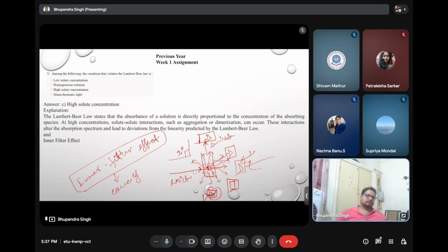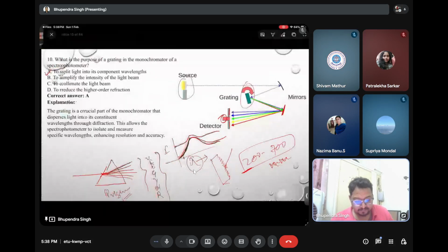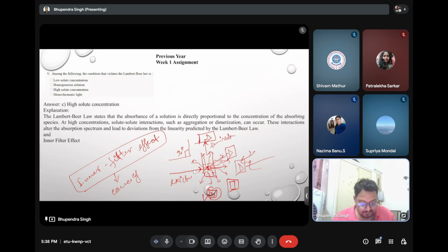Any wild guesses? Okay. So it is at 90 degrees because when you place the detector at this position, you will detect the transmitted light also with the emission, because not all the light you are giving for the excitation will be absorbed by your sample.